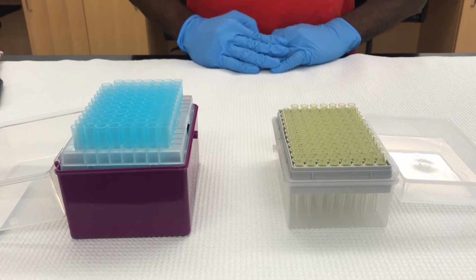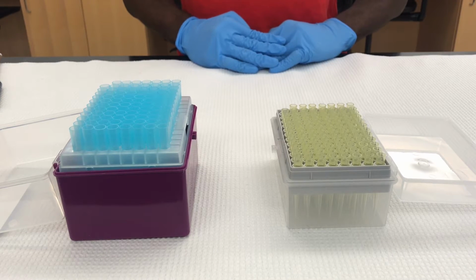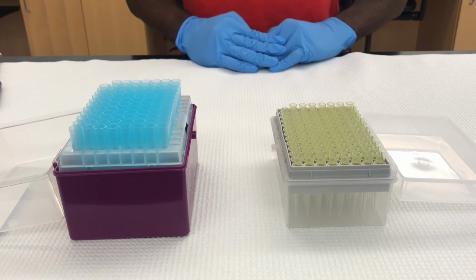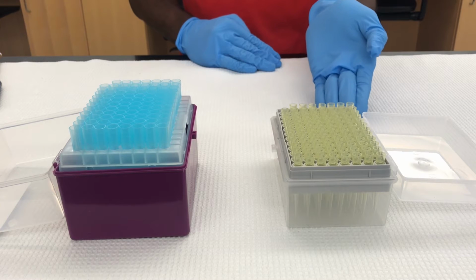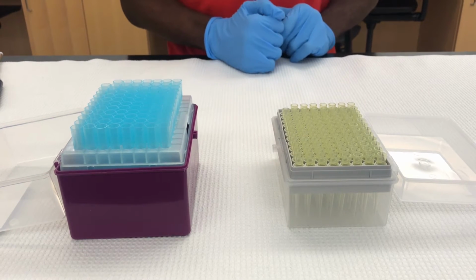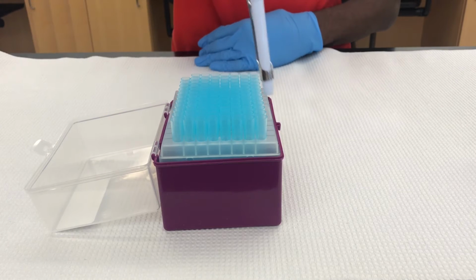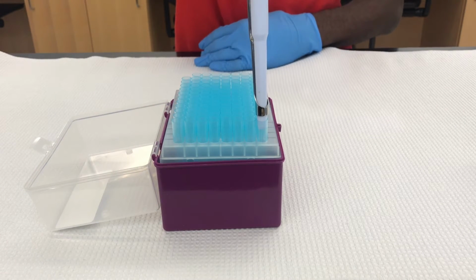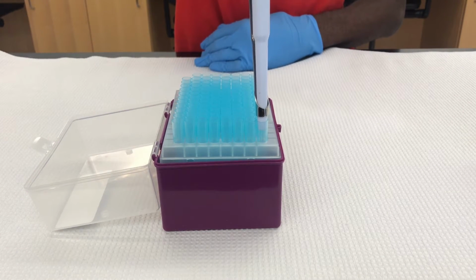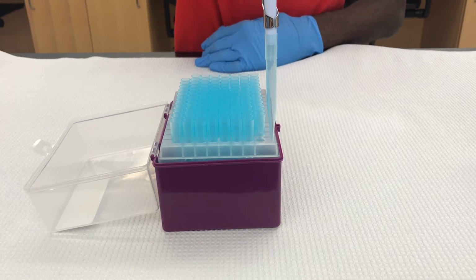In order to take up the desired volume of liquid, you must first place a plastic pipette tip on the end of the micropipette. Different micropipettes use different pipette tips. The P20 and P200 pipettes use the yellow tips. The P1000 uses the blue tips. Be sure to use the correct tip for your micropipette. To put a tip on the end of the micropipette, gently but firmly insert the end of the micropipette into the pipette tip. Do not bang on the tip as it may damage the micropipette.